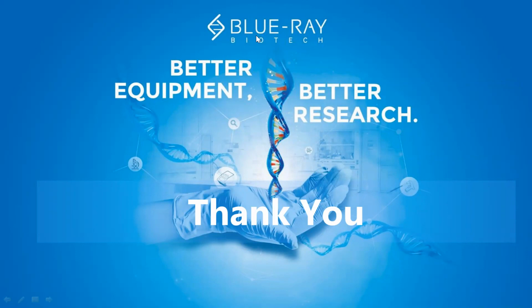Frank? Yeah, I think we use the 10x and 20x lenses. So if you use your microscope with 10x and 20x, you can use EzScope. It's okay. Normally cell size is maybe around 20 to 70 micrometers. That's okay for the EzScope.